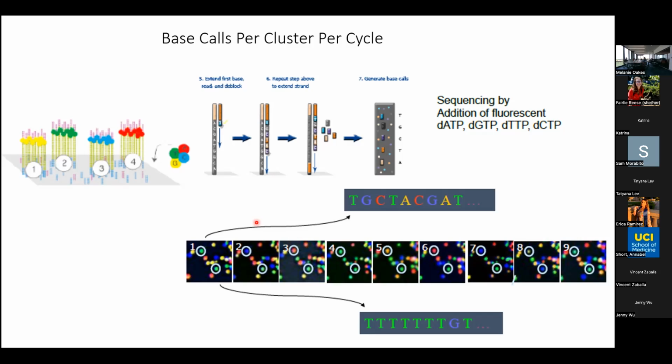And so again, just to make sure I have everything straight: when you're talking about read depth, that basically translates to number of clusters. Yes. Is that correct? Okay. Yes. So some people will say 20 million is for sure going to give you your high expressors, meaning those transcripts in higher abundance, you're going to see more of those. If you came to me and said, I've got some low expressors that I'm worried about, then we need to increase the depth and see if we can get more. So we might go to 40 million. Then you're spending $68.